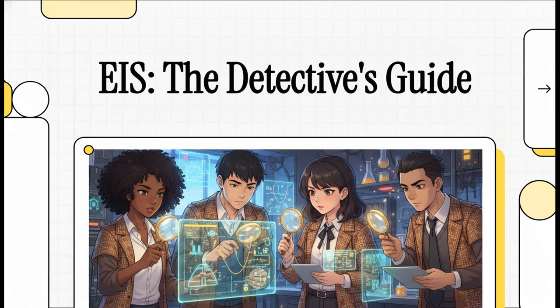Welcome to this explainer. Today, we're unpacking a technique that is honestly one of the most powerful, yet totally invisible, analytical tools in modern electrochemistry. It's this hidden diagnostic powerhouse that's quietly working to optimize everything from the battery inside your smartphone all the way to cutting-edge biosensors used in modern medicine. We are talking about electrochemical impedance spectroscopy, or EIS. So, let's embark on an investigator's journey together and uncover how this all actually works. Let's get right to it.